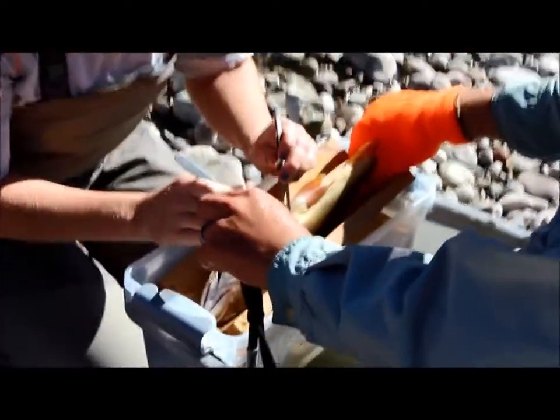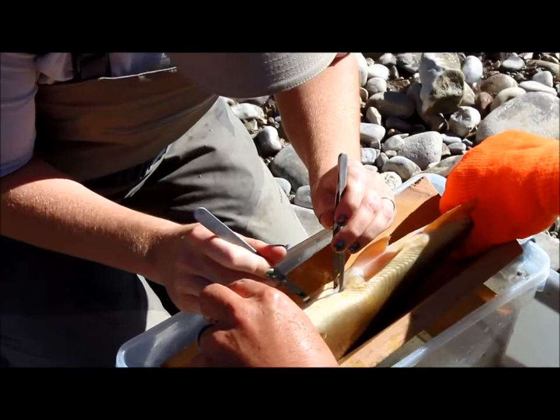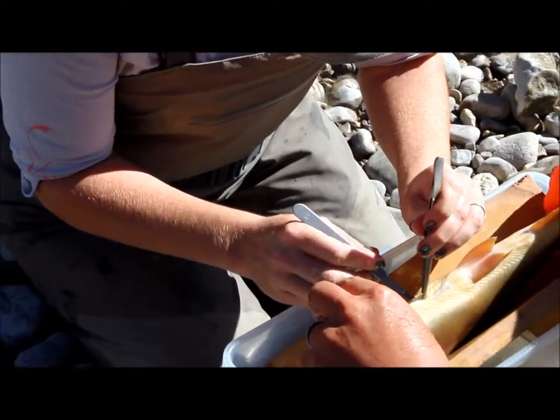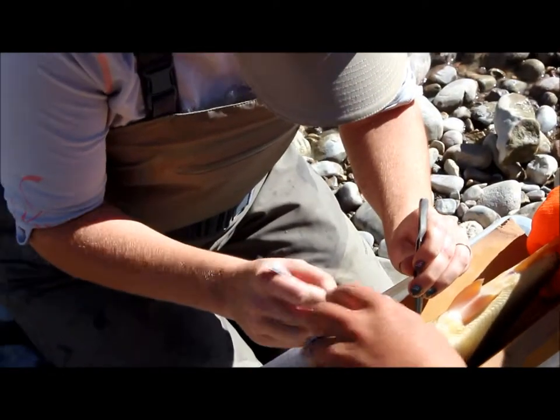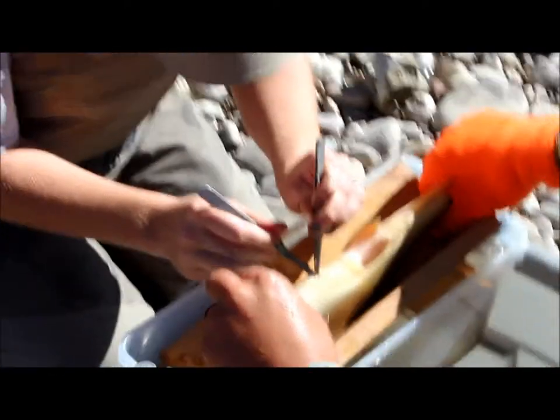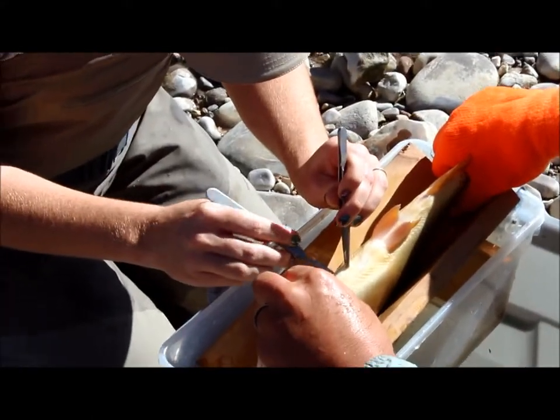We're going to make it big enough for the tag to fit through. Leave it fatty because we've got a big layer to go through.